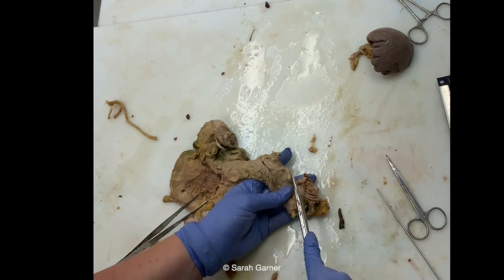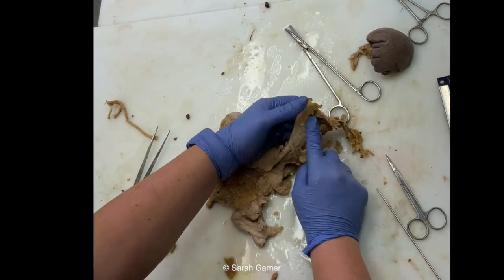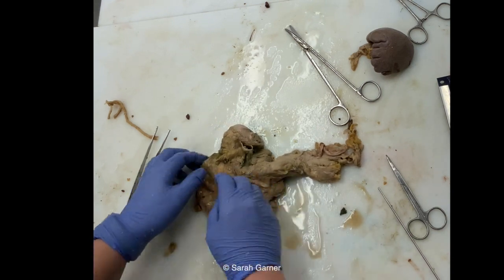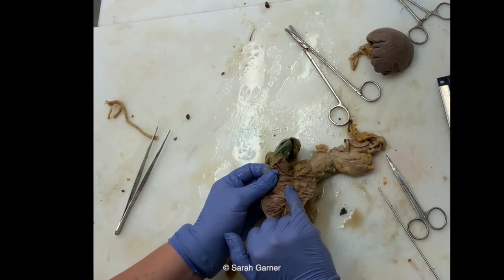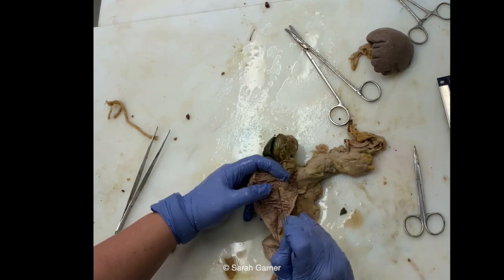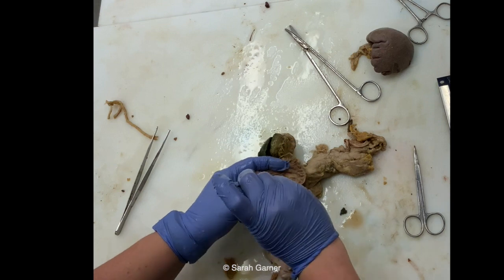Okay, so imagine that we followed that all the way up. I don't want to make you watch that forever, but you could do the same with the splenic vein right here. So the main thing I want to show you is this Whipple section, or this opening here. Once you've got this all cleaned out, you should be able to pretty easily find your major duodenal papilla. Honestly, I don't think this is going to section very well because it's so fixed. But if you can find that, that's your papilla, and you can stick your probe in there.